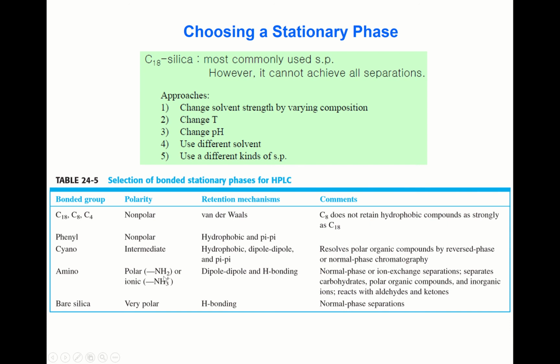Okay, this amine group takes a positive charge by accepting the proton, especially at neutral or acidic pH. So this amino bonded phase is good for polar molecules, polar organic compounds, and inorganic ions, and it interacts with aldehydes and ketones.